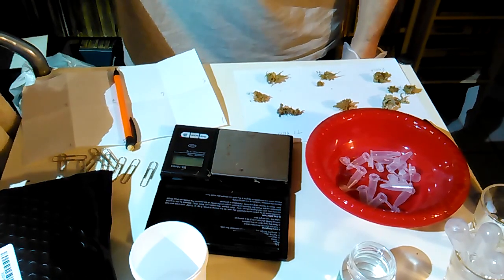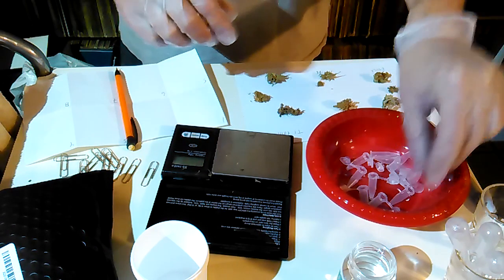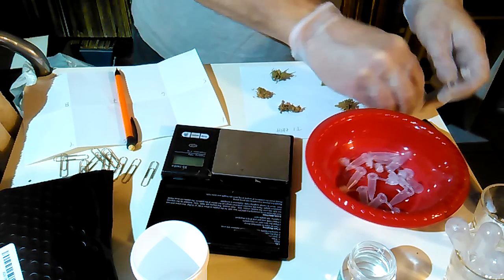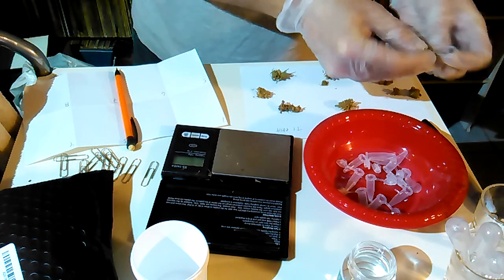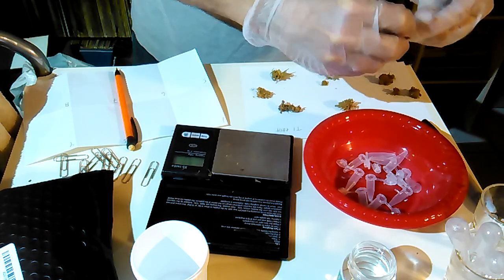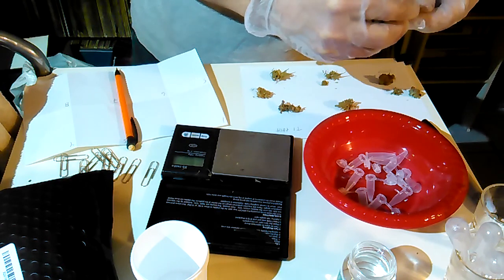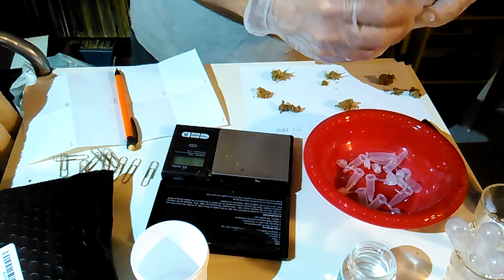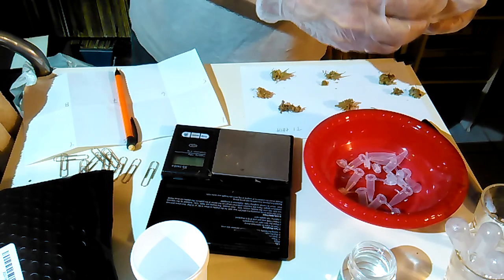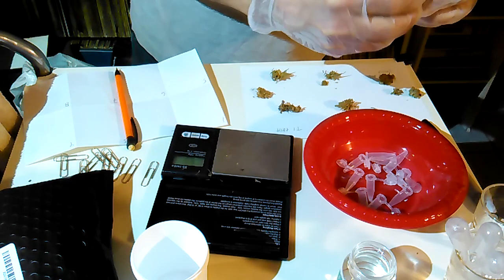So first we're going to mix the samples with the alcohol in their little tubes. So I'm going to take these, I already have them sort of separated. It's supposed to be 0.1 grams, but I just eye it out, whatever will fit into these little tubes. It doesn't give you a very quantitative measurement anyway, so it's sort of a waste of time to try to get really exact with all these measurements.